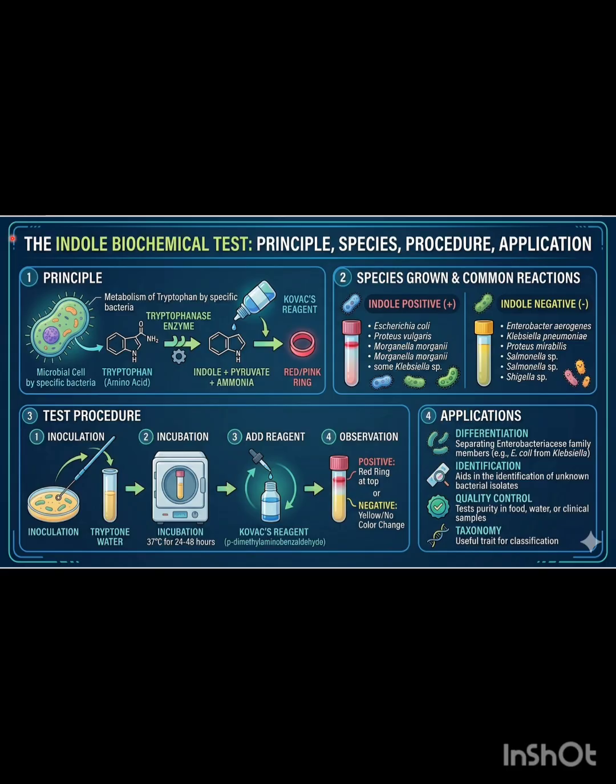Now, after preparing the broth, we are going to do inoculation. What is an inoculum? Inoculum is where we take the old species and add it to the new area. After adding this, we are going to grow them. That is known as incubation. We are going to increase the bacteria in number. After this incubation, we will either add a reagent or observe the results directly.